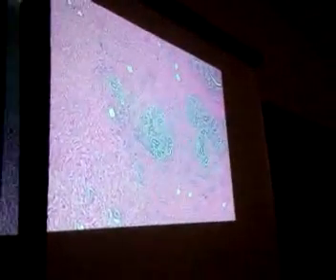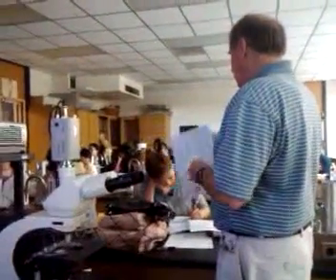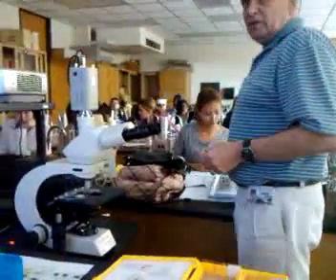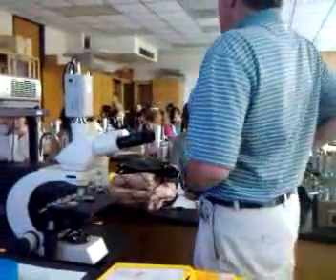So on an inactive, I'm not going to go with the active mammary gland and all that business for lactating. I'm not going to that. So we can do that part right there. We can at least do that much without any problem. Okay? Everybody see that pretty good? You get that all right? Now, let me show you something else real quick, and we're about done lining these slides.